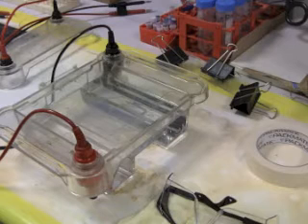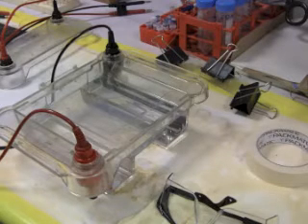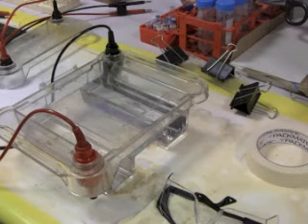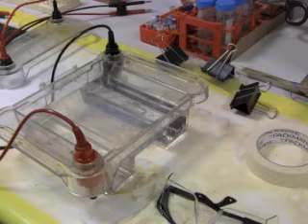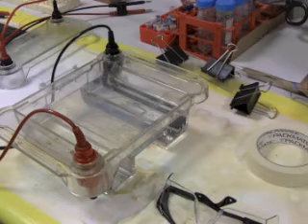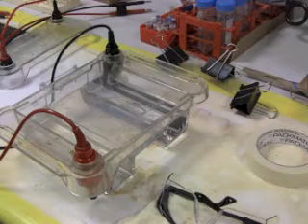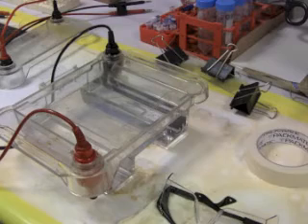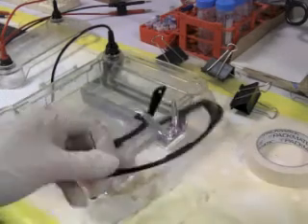This stain binds DNA in a gel, so it can potentially also bind your DNA. So it's vital that you are very careful with this stain. It has been shown to be able to mutate DNA. This means that it is a potential cancer-causing agent. So the take-home message here is: be very careful. You will need to increase the amount of protection that you've got — this means using glasses and also latex gloves.